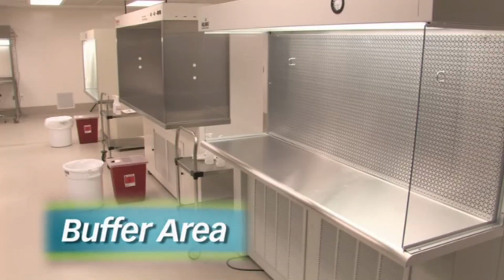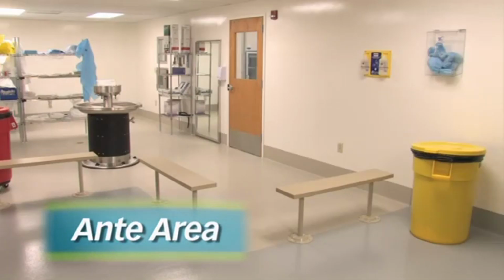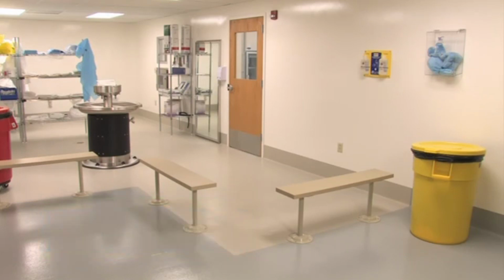Here's an example of a clean room or buffer area. Note that the room is free of any extraneous devices or storage. Here's an example of an Ante area. Following USP standards, an actual Ante room is not required when compounding low and medium risk level CSPs. A separate Ante room is required for high risk level compounding.